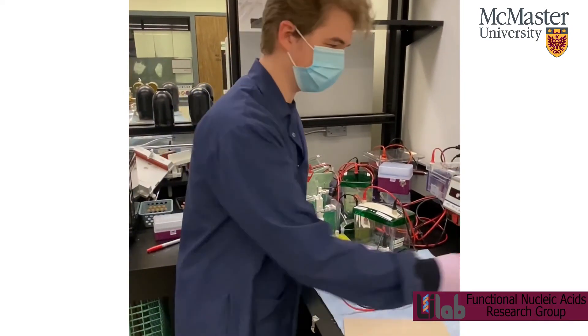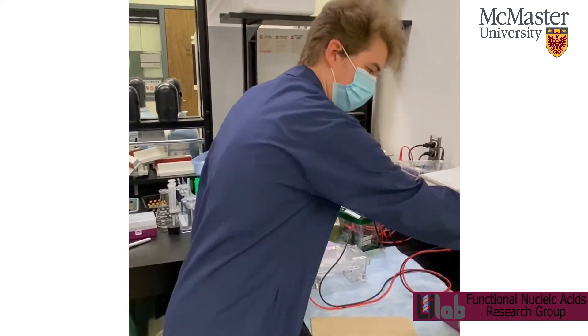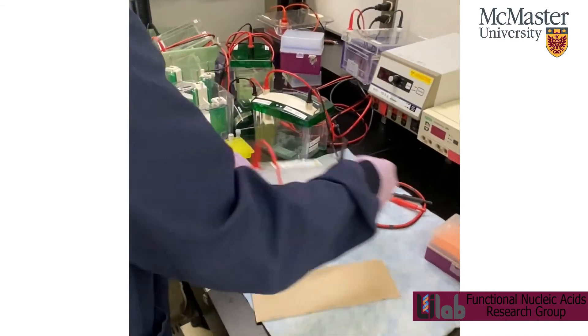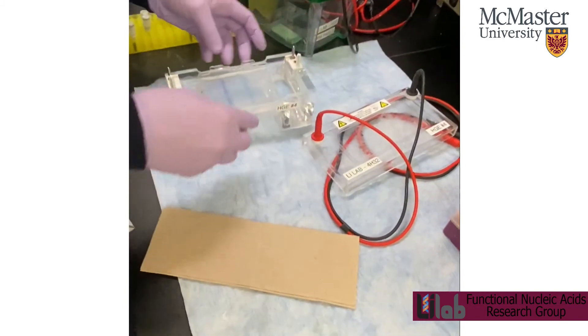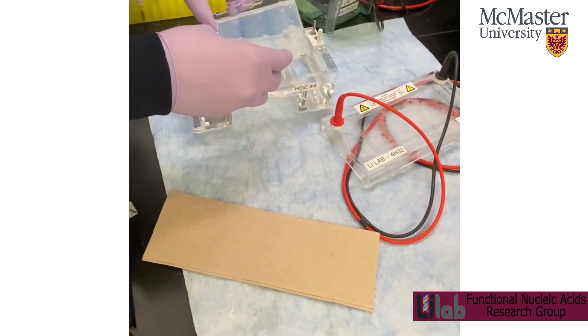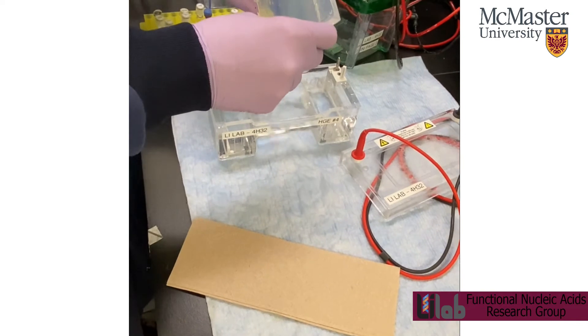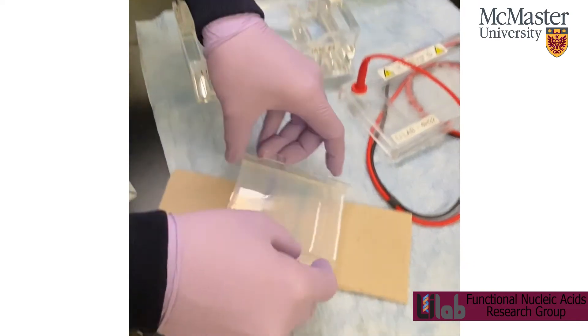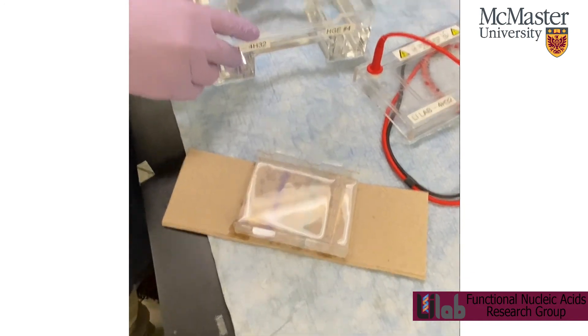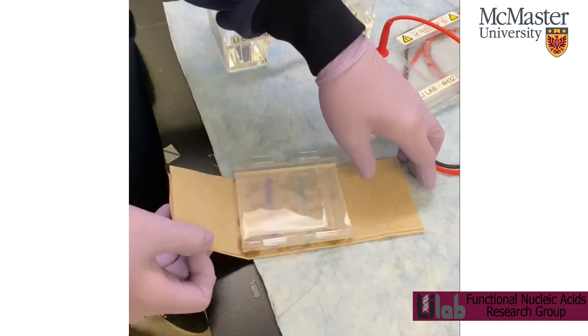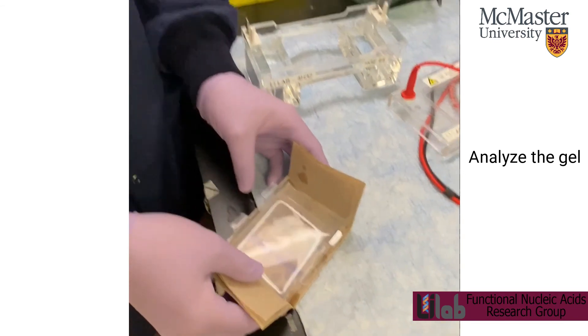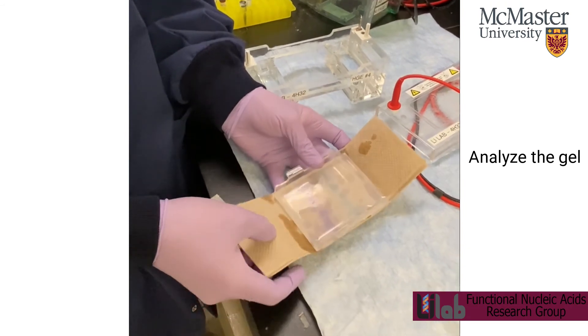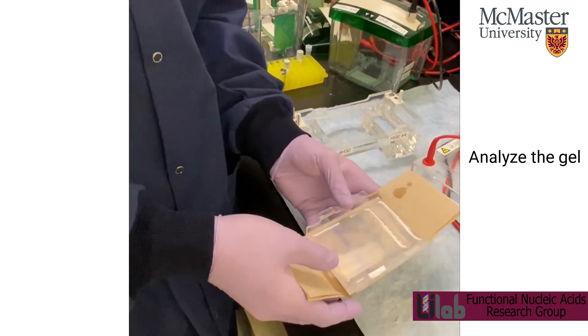Okay, so when your gel is done, you can turn it off. And then unplug the leads. And you can remove your gel from the apparatus. Just drain some of the buffer. And then this can just go down the sink and rinse with water. And then the gel itself you can analyze either in the Typhoon in the CMCB or in the blue light in the darkroom. So I can show you what it would look like under the blue light.